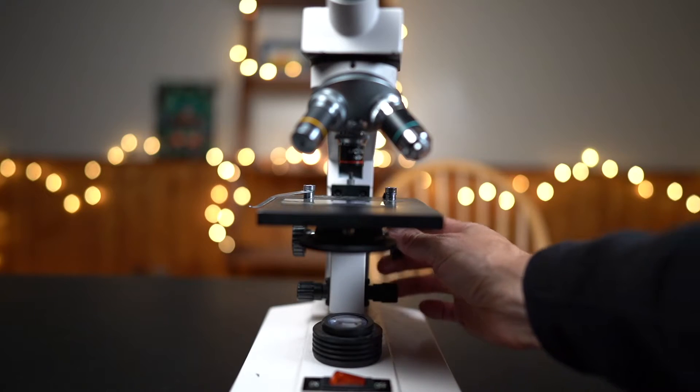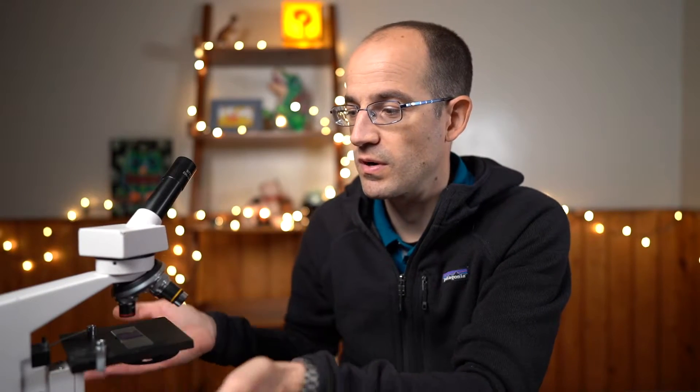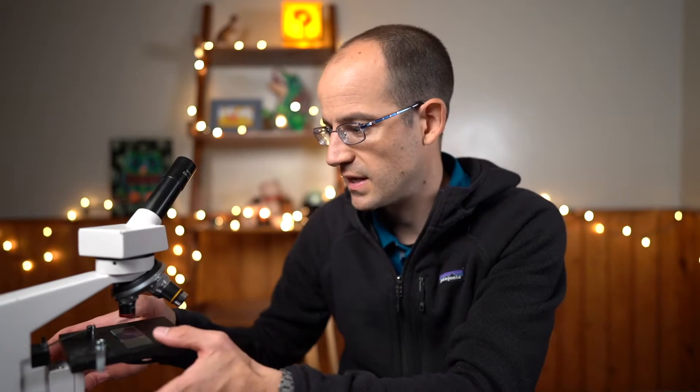I will put that under my microscope. I am going to start at low power, bring my stage all the way up, put the slide in the center, and make sure it is on — we have gone over that multiple times in previous episodes, so hopefully it is becoming second nature.